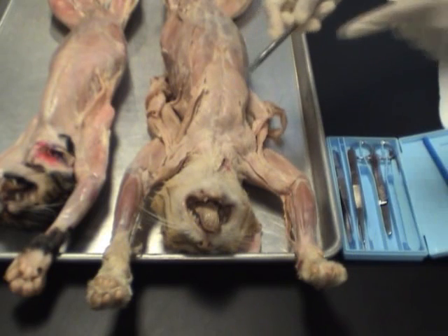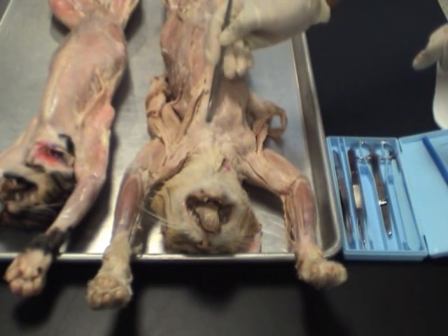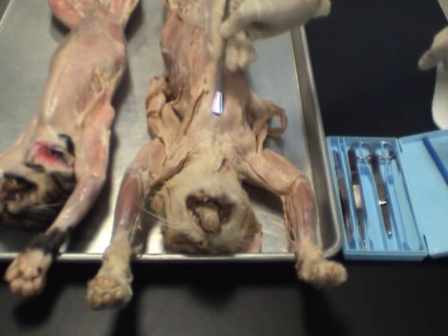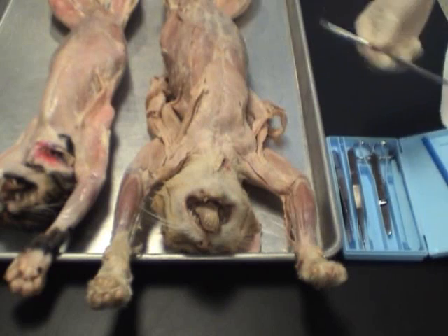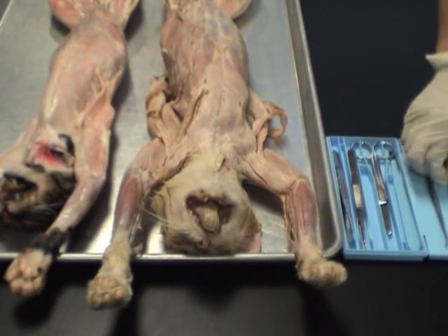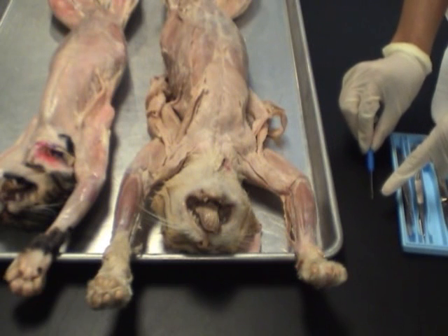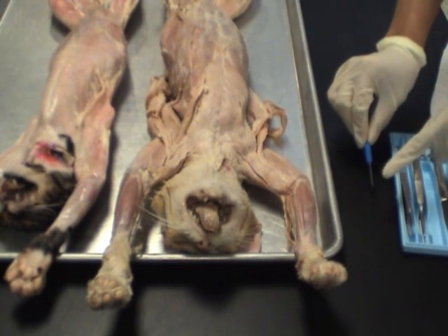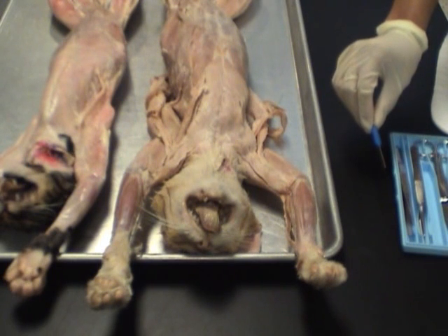In addition, you can use the beveled end to cut away at soft connective tissue as well. Okay, it will break soft connective tissue easily. The other kind of probe we have here is this probe. And as you can see, it has a pointy end, and for this you can actually pierce the flesh and it will stay in place.